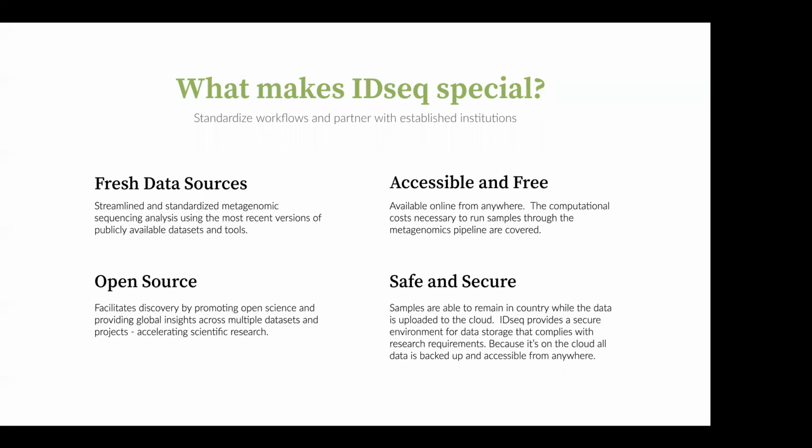We are committed to always providing IDseq as a free service, so we take on that computational cost. You can access IDseq anywhere online, and so it's really easy to jump on the tool and start your work no matter where you are, as long as you have an internet connection, pretty much. And lastly, I just wanted to highlight that IDseq is safe and secure, and that we take privacy very seriously on our team and make sure that we are following best practices in that area.